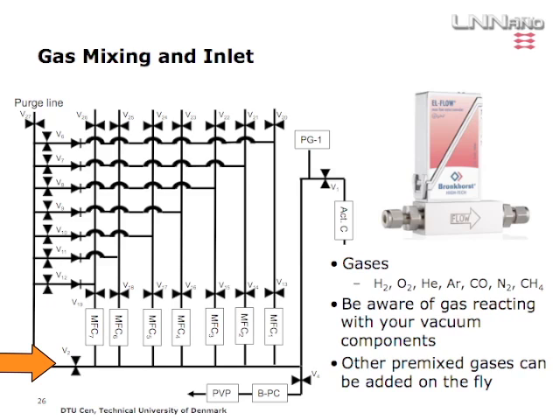We have up here the manifold where the gases are mixed after coming through the mass flow controllers. Then we leak it into the microscope over here where we can measure the pressure just before it goes into the microscope. And if we want to get a good mixing, we would increase the flow to a very high level and then just remove most of the gas to make sure we have a nice mixing in the manifold here. We do that by having a pressure controller on the manifold. And then we can just pump out much of the gas this way.